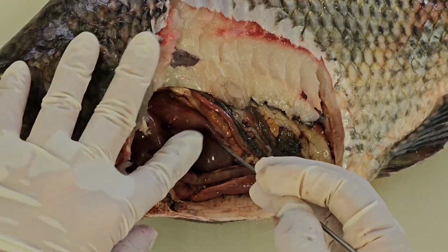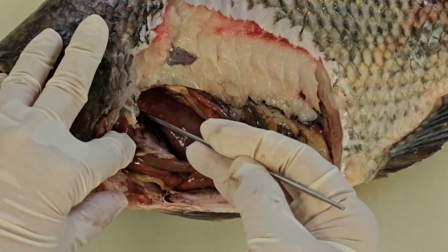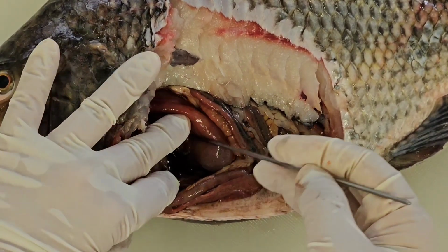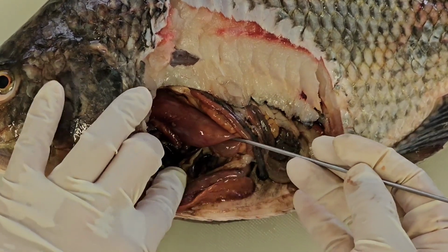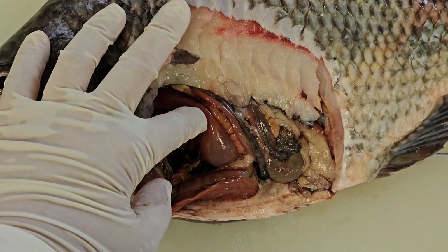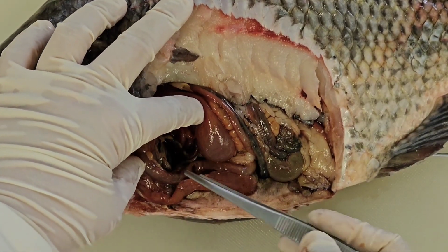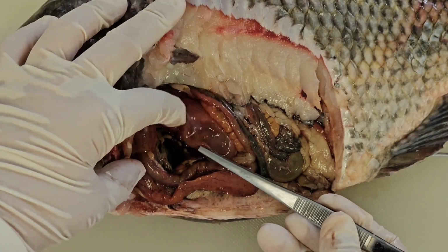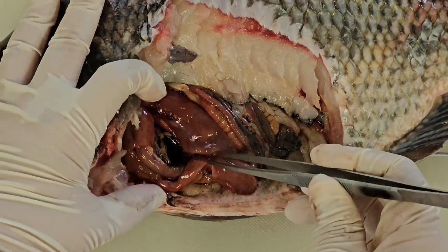If you look behind the stomach, you can see the structure of the spleen. Underneath, I will try to show you the spleen. So normally it will be red in color. I will try to use the forceps to hold it. So you can see this structure, right? The red color there.